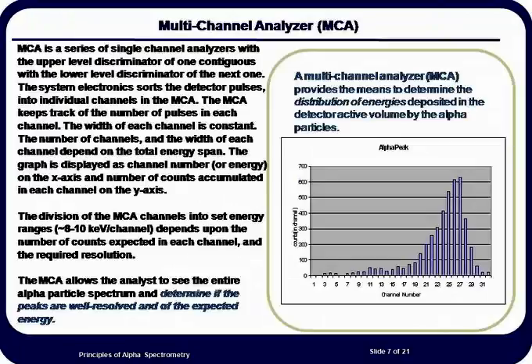Current alpha spectrometric detectors can be calibrated so that each channel corresponds to approximately 8 to 10 keV of energy. The spectrum shown on the slide is a histogram showing the number of counts recorded in each channel. Note that even though alpha particle energies based on the nuclear decay should be monoergic, that is, one energy, the alpha spectrum is spread out over several channels or energies. This spread of energy is due to the way alpha particles interact with matter.